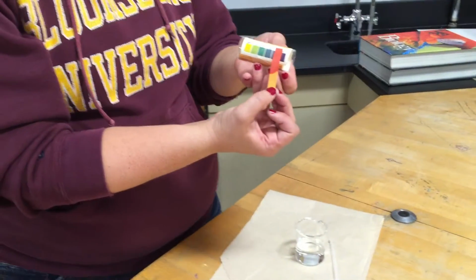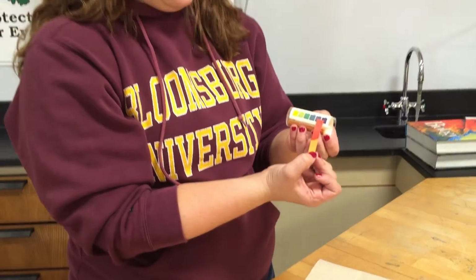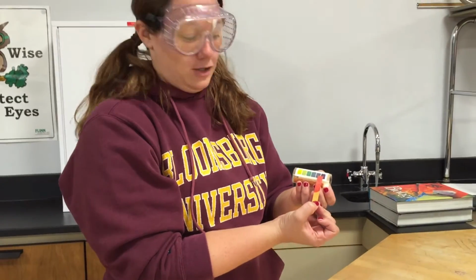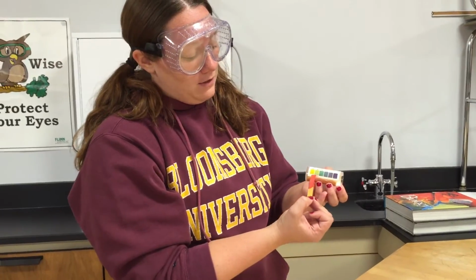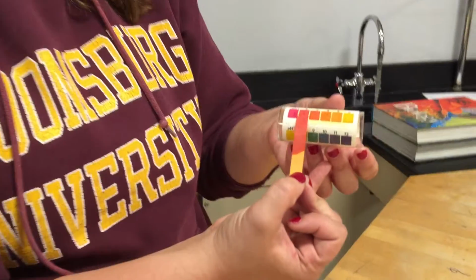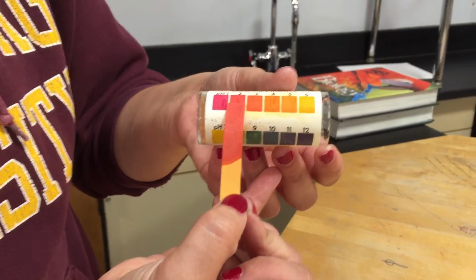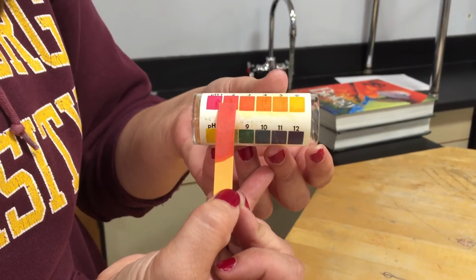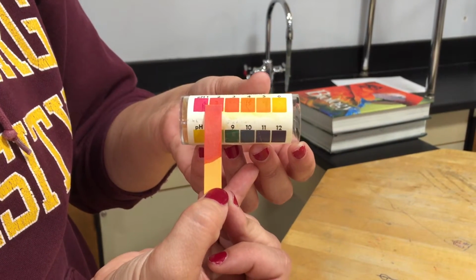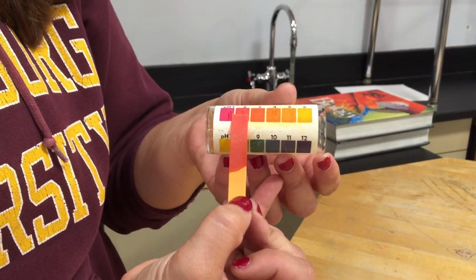to the colors and try to determine the pH. Very clearly, it's not a pH of 12. If that color matches to you, we want to find you a doctor. So we're going to continue moving it along our pH scale until we find an area where it looks like it's about the same. And you can see right around 1, 2, 3, we're getting close. If it's not all the way dry, you're not going to get a great reading. So make sure that it is all the way dry, and you can see that this pH lines up closest with the pH of 2.